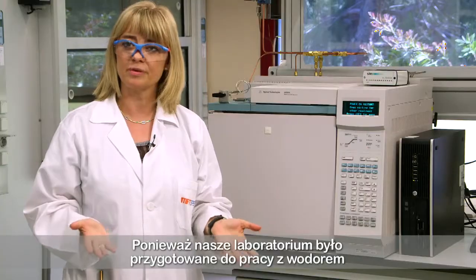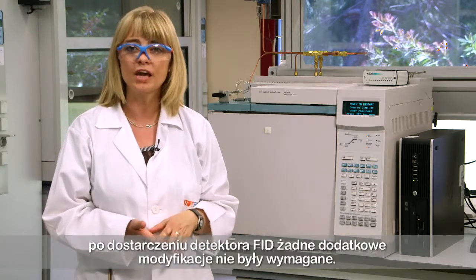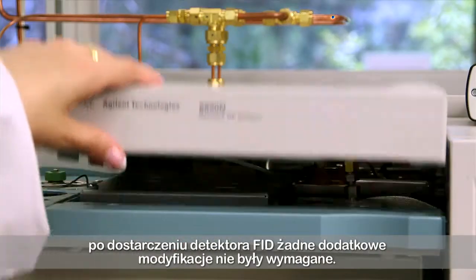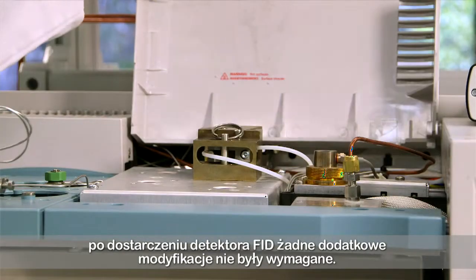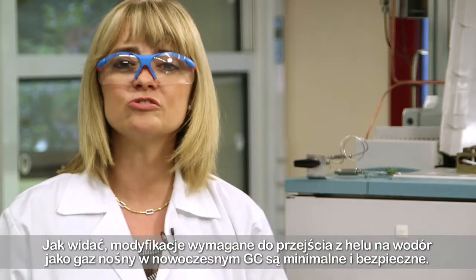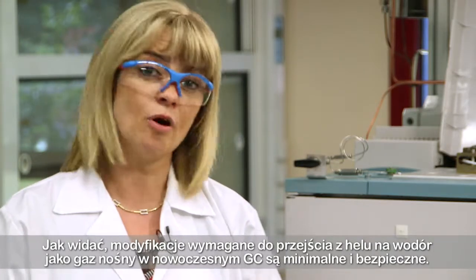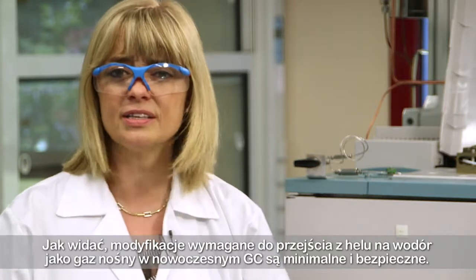As our lab was already prepared for work using hydrogen with the supply of the FID detector, no further modifications were required. As you can see, the modifications to move from helium to hydrogen as a carrier gas in a modern GC are minimal and safe.